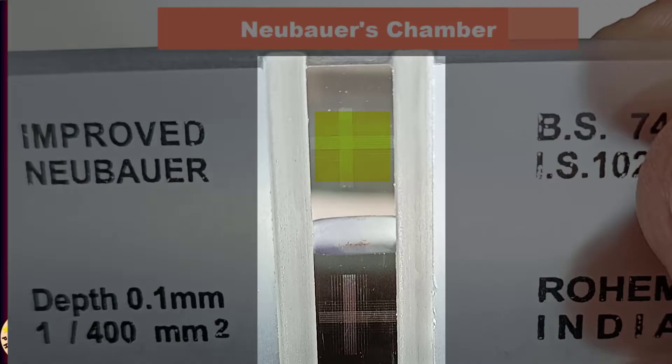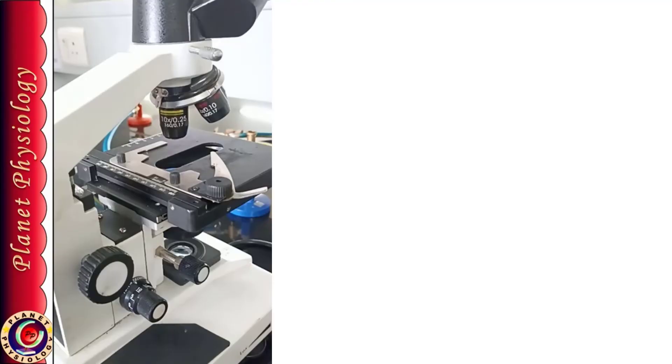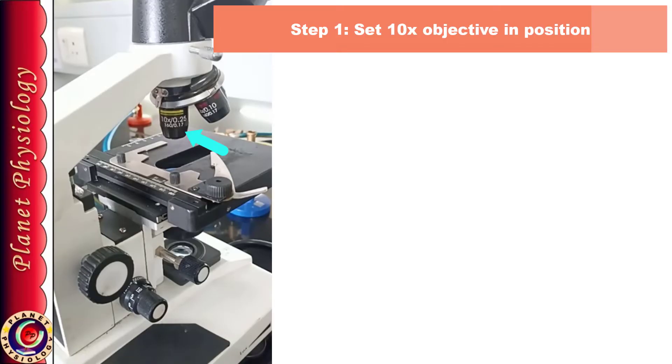So the very first step is, make sure that your microscope has low power objective lens in position. This is very important and many times students don't pay attention to this part. So before you begin, make sure that you are using low power, i.e. 10x objective.